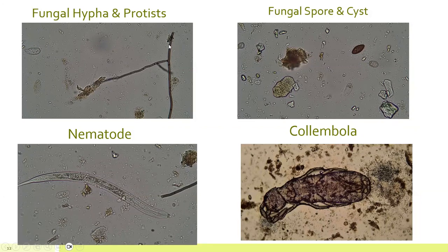And then here you have a fungal hyphae. This is probably of Basidiomycete based on the septa. You can see the septa here. There's just cross walls throughout. It's branching, it's nice and healthy, it's dark. There's theories that this melanin is coming from to protect themselves from solar radiation.